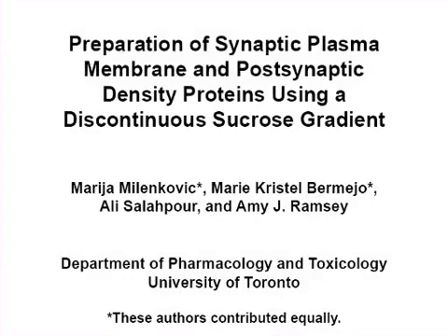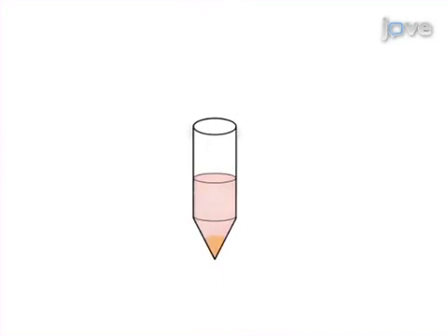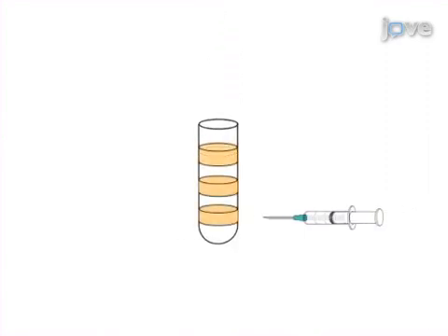The overall goal of this procedure is to demonstrate subcellular fractionation of brain tissue using a discontinuous sucrose gradient to enrich for proteins from the synaptic membranes and postsynaptic densities. This is accomplished by first homogenizing the brain tissue with a powered homogenizer, followed by a series of centrifugation steps to prepare crude membrane protein extracts. The membrane extracts are then layered on a discontinuous sucrose gradient for ultracentrifugation. The final step is to collect the proteins from the gradient.